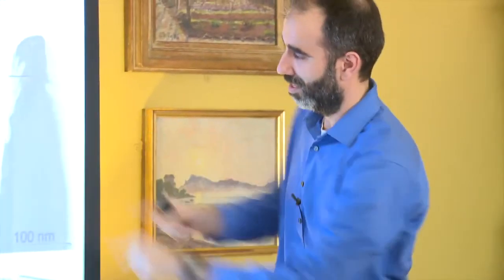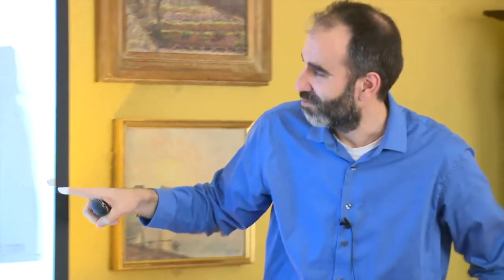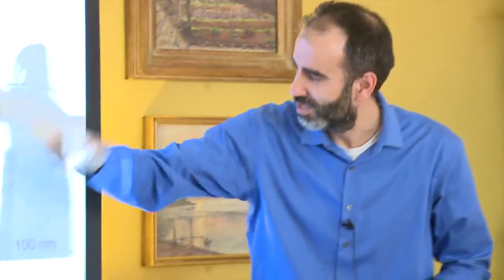What we do here is we prepare pieces of metal in the form of a needle. The needle is very, very thin. You can see this is one of these needles in this microscope, actually. Because they are so small, we need that microscope to see what goes into this one. They could be as thick as 100 nanometers.